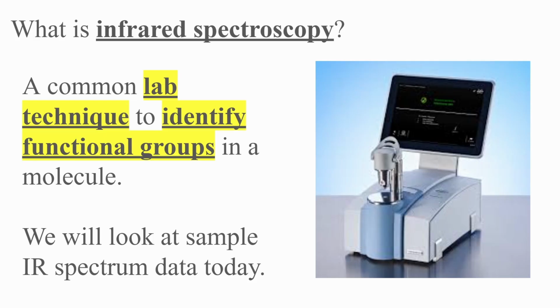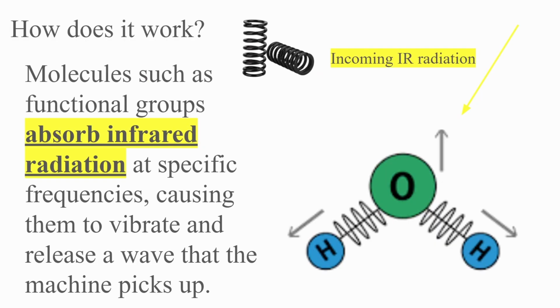Since you guys don't have to do this, we'll just simply explain in general the theory about how it works. What you will learn in chemistry in much more detail is that molecules and atoms all absorb a certain amount of light and then reflect it off. In particular, they discovered that they absorb infrared radiation at specific frequencies, therefore creating a pattern.